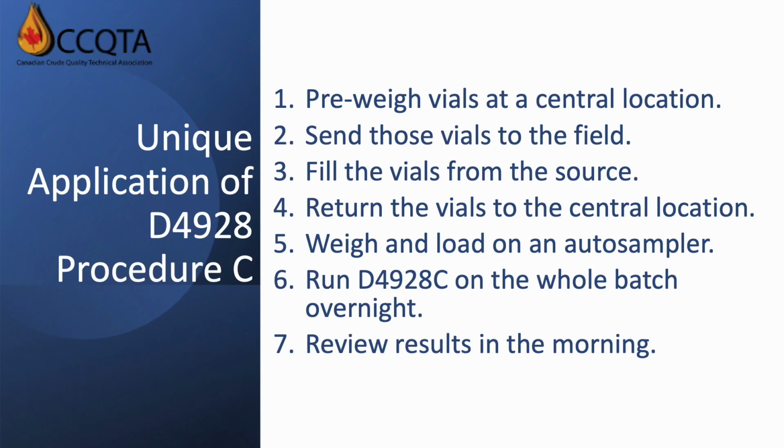This process flow eliminates any of the issues with homogenization because the whole sample is used, so all the water detected is related to the original mass of the sample in the vial. Sampling in duplicate and or triplicate also allows easy storage of retained samples should they be needed in the future. Since the vials are very small, about 20 ml, many retains could be stored in comparison to 1 liter bottles.